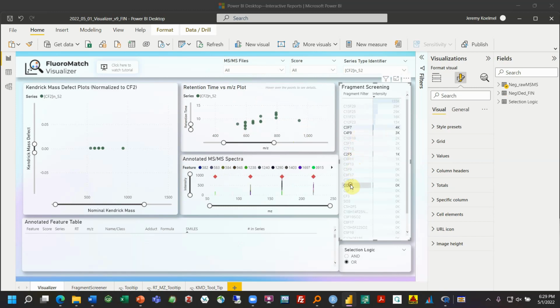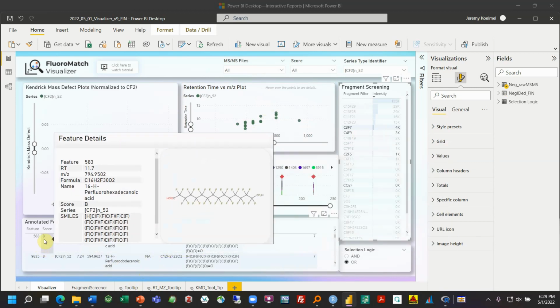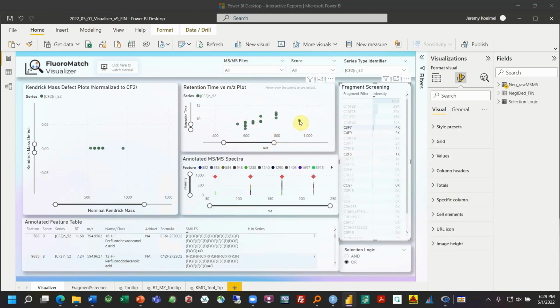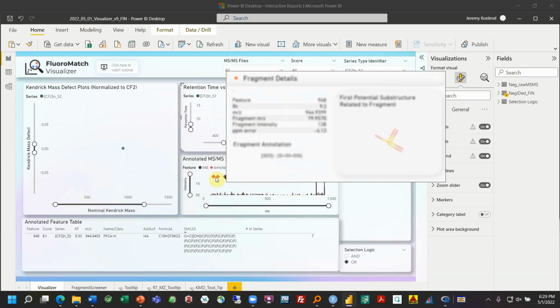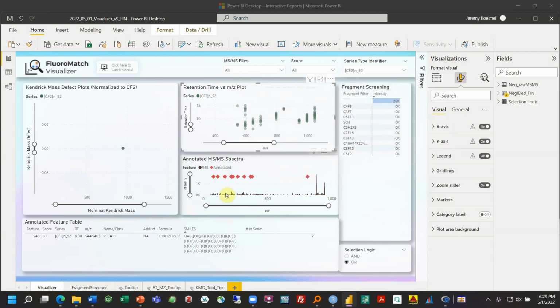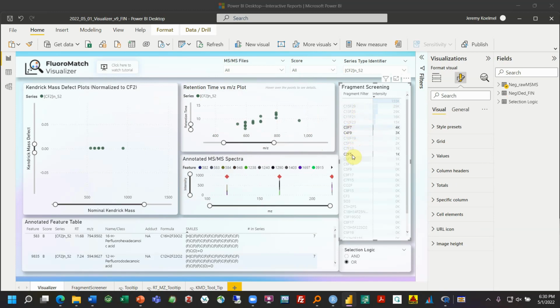So in this case, when we're taking our notes, we may want to export this table and only include those feature numbers here. And this even looks a little out of range. So let's just see. It's MSMS spectra. Seems to have a lot of annotated fragments. C3F7 being fairly abundant. C4F9 also being fairly abundant. So I might be somewhat confident in the species actually. So we can start filtering by those that contain some of these fragments and then just export this table.